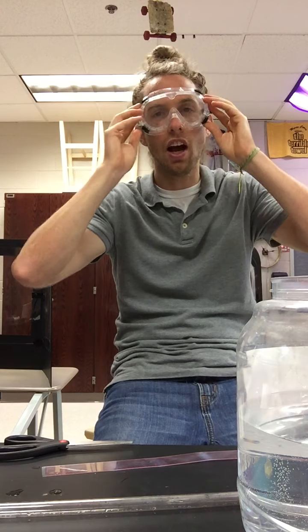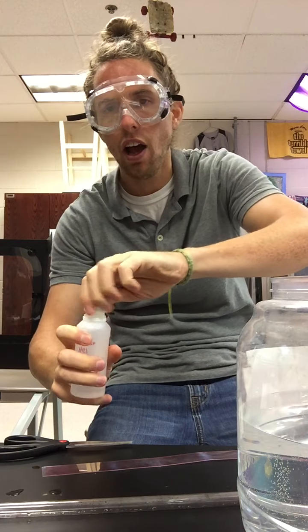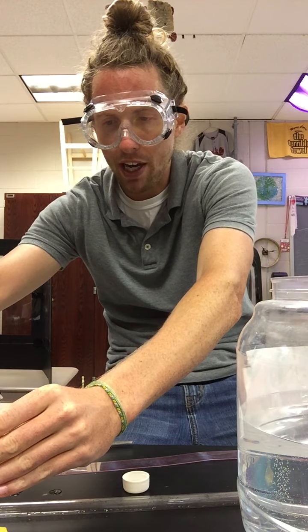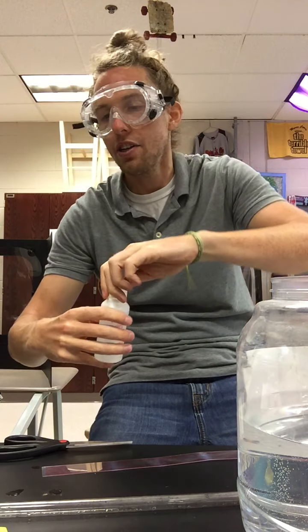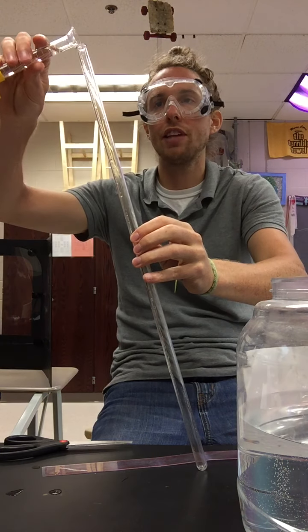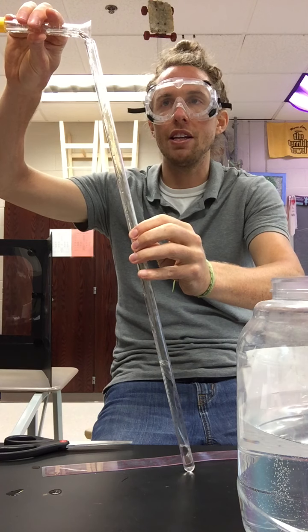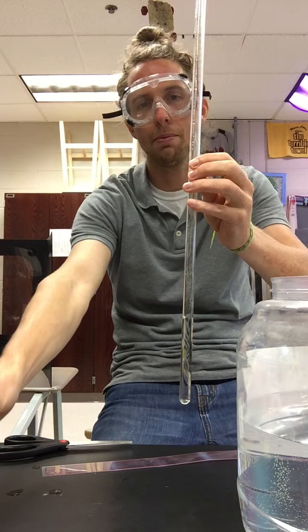Okay, we're going to start this thing off. I need goggles, of course. I am going to go ahead and measure up 10 milliliters of my 4 molar hydrochloric acid. I'm not going to measure very precisely because the hydrochloric acid in this reaction is in excess. So the magnesium is actually my limiting reactant. I need about 10 milliliters to make sure that the acid is in excess, but the exact volume is rather inconsequential, so we don't need to record that volume on our data table.